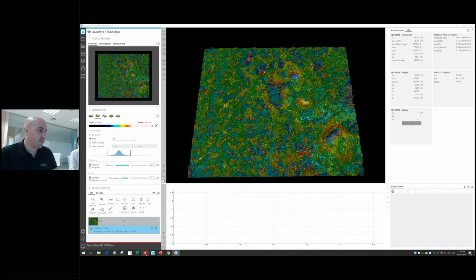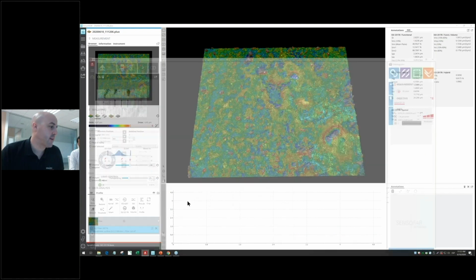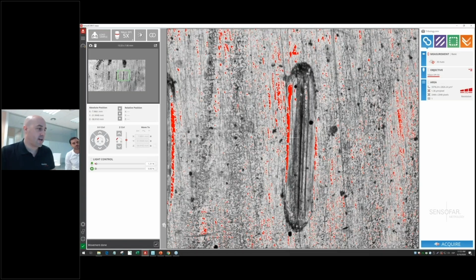Minimize that. Let me open the Sensoscan software, which is our proprietary software to manage the system and to take the decisions. Here we have exactly the same sample we used for the presentation. So how do we normally operate with this system?